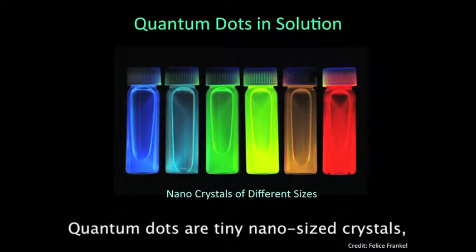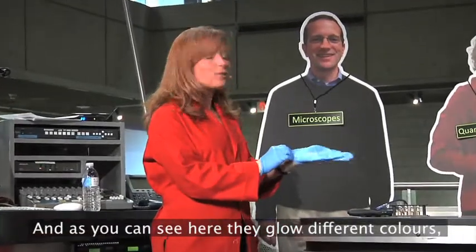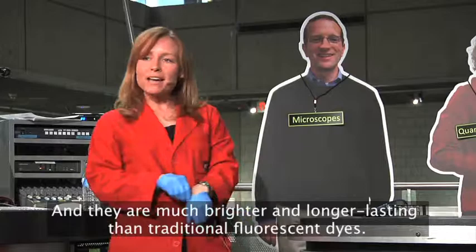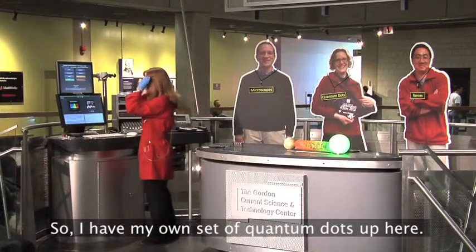Quantum dots are tiny nano-sized crystals that when you excite them with a laser, they give off light very brightly and they glow. And as you can see here, they glow different colors. They can be tuned to give off different wavelengths of light. And they're much brighter and longer lasting than traditional fluorescent dyes. So I have my own set of quantum dots up here.